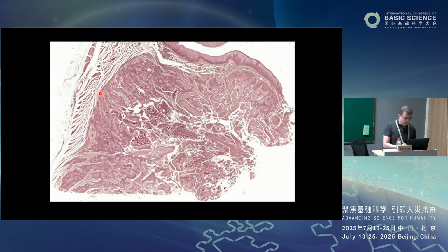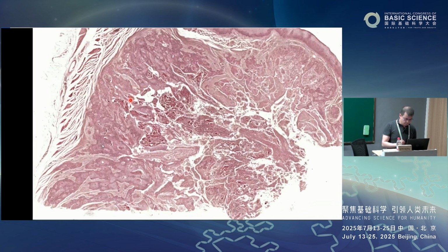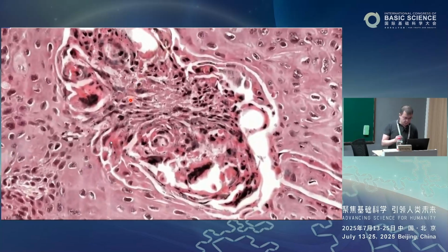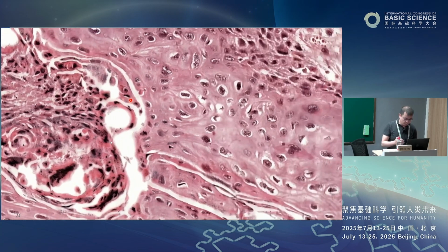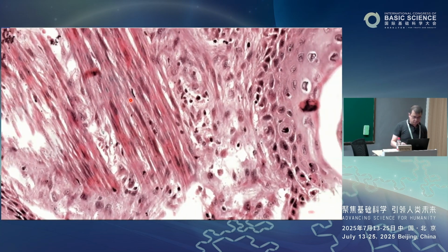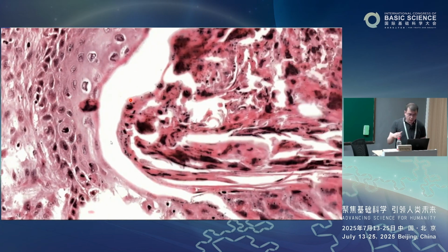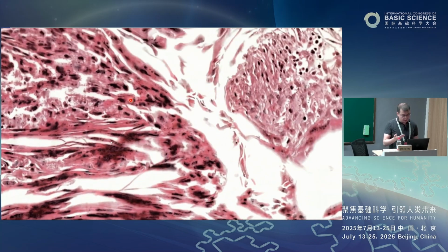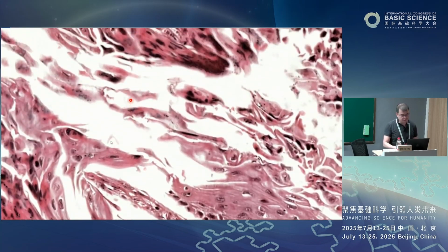You can zoom into different parts of the sample, and you can still see the very fine details of the cells. The entire image contains more than 10 gigapixels using this lensless imaging device.